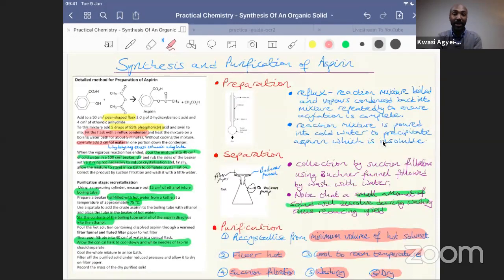A drying oven typically has a vacuum and is set to a temperature well below the melting point of your solid, or well below a temperature that would decompose your solid. You've also got a vacuum line to the oven, so that any vapors from solvent or water get sucked out of the oven. That's a fairly high-tech piece of kit for a school lab, so you're unlikely to see a vacuum oven in a school lab.